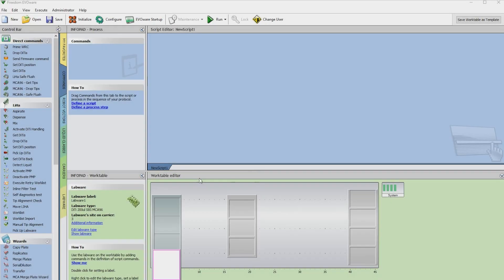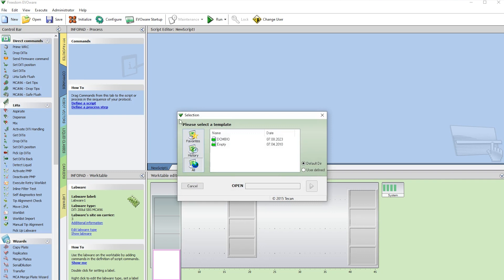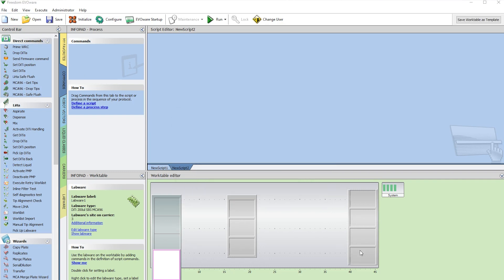To get things started, first we'll need to select a new script, select the deck that you're using, and then go.